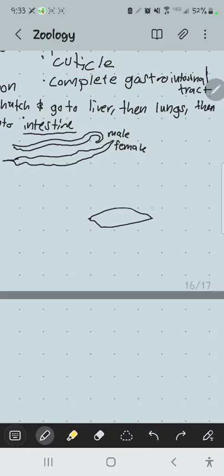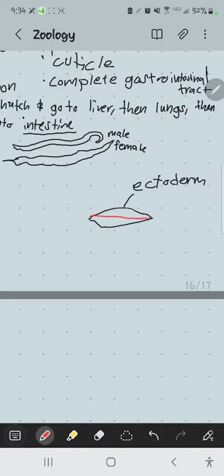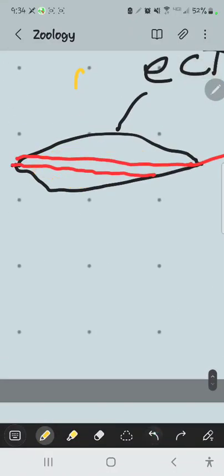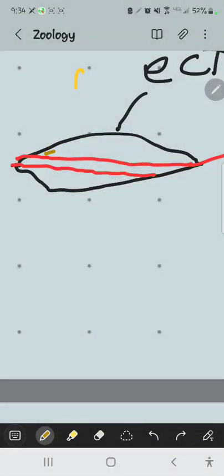And this is the gastrointestinal tract. So the gastrointestinal tract is entirely made of endoderm. It's kind of the main theme here. And then the mesoderm, which is mostly muscle, is lining the outside of the body cavity. This is our mesoderm. Alright, so here is our mesoderm. And so this cavity here, this is what is called the pseudocoelom.